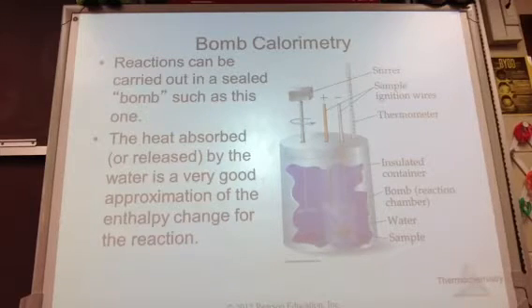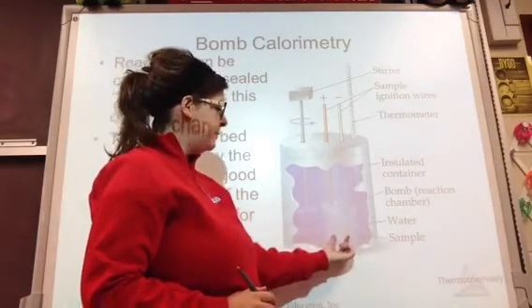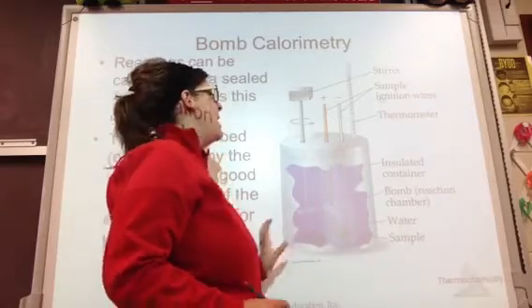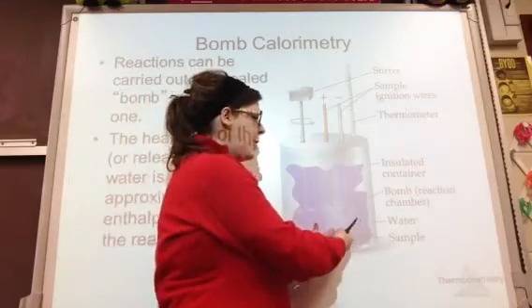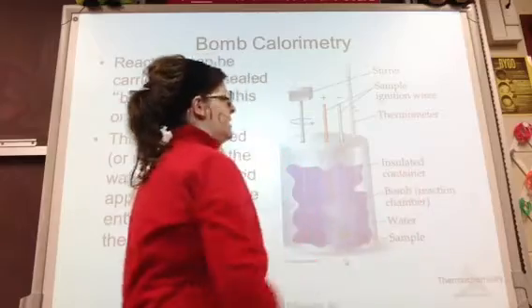And this bomb has an inlet valve for adding oxygen, and other things like electrical leads. That may just be so that I can change different things about the calorimeter itself. So I have my bomb, my reaction chamber. My sample's here. I've placed that sample in the reaction chamber in this bomb, and then I'm going to place that bomb inside a bigger insulated container. So we have all of these containers within containers. I have my sample, I have my bomb, my reaction chamber, and then I have my big insulated container overall.